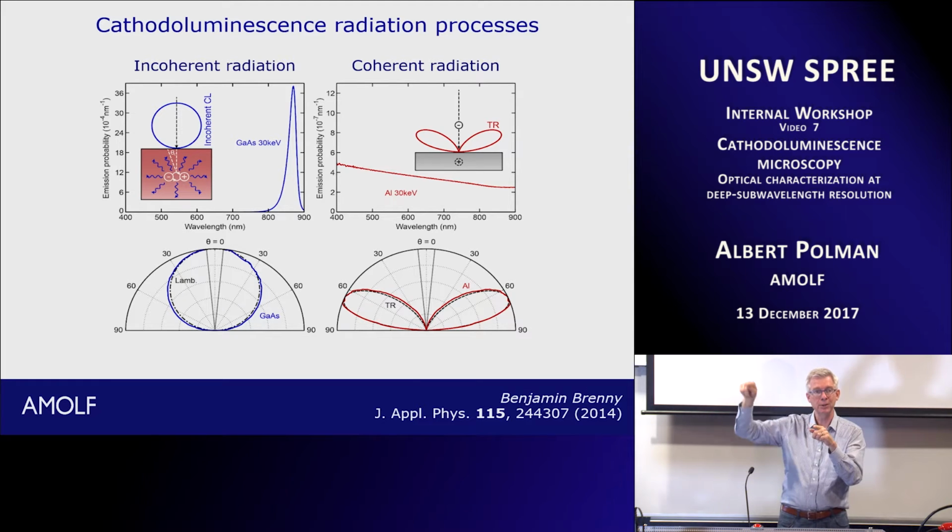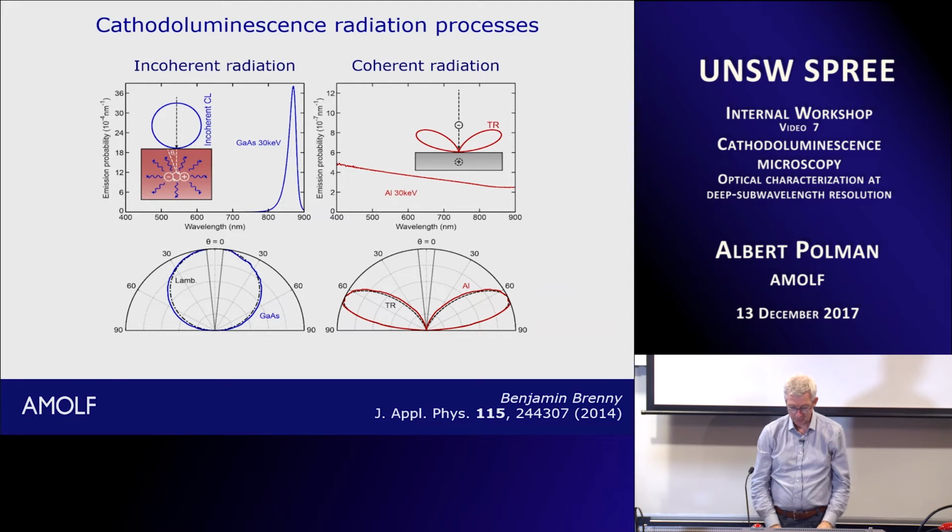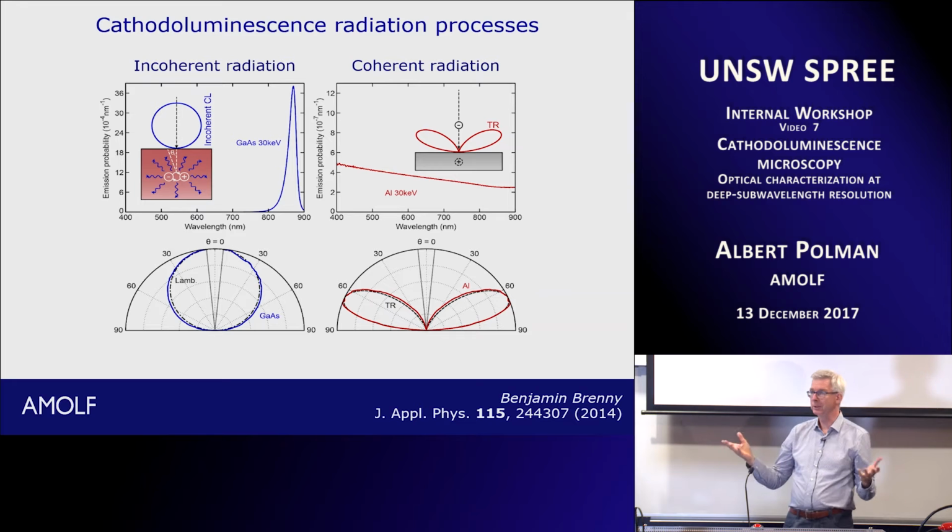It's called Lambertian distribution of the light that's emitted. So most is going out, and the further you go away, the less the intensity. So that will happen with any bulk material that you hit with an electron beam that can radiate light, a semiconductor, a diamond NV center if you're interested in quantum optics, erbium doped glass if you're interested in telecommunications and so on.